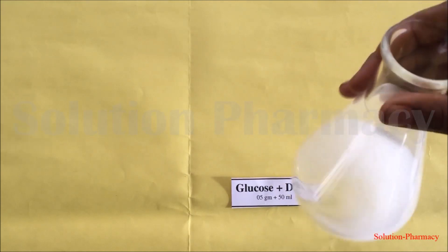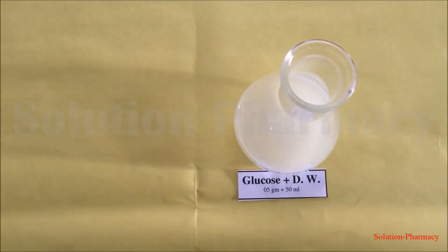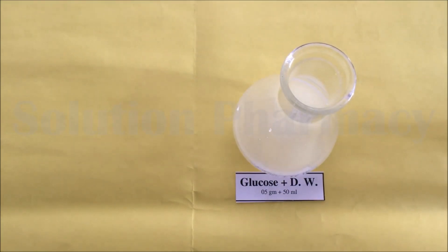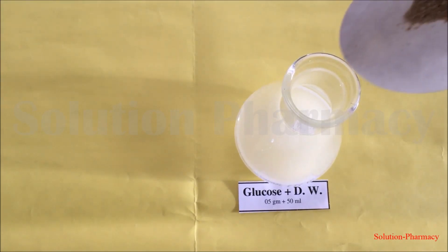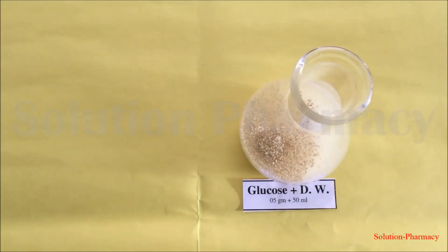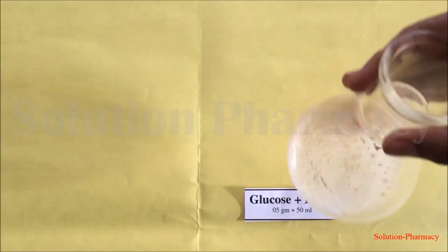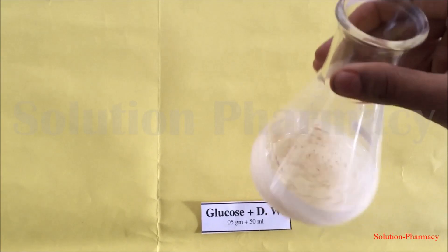After dissolving the glucose powder in distilled water, weigh 1 gram of yeast powder and add it into the glucose solution. After transferring the yeast, the enzyme present in yeast converts glucose into ethanol and carbon dioxide, and energy is released.